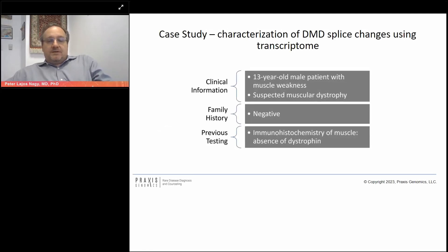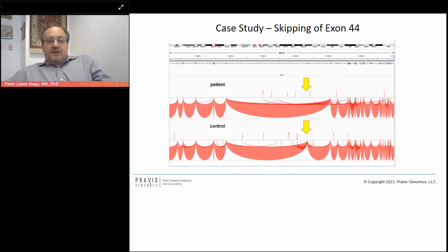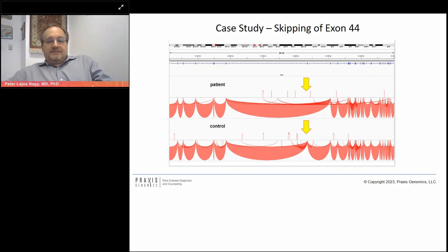Duchenne muscular dystrophy is often caused by splicing defects. Here I show an example of how you can demonstrate the absence of an exon using transcriptome sequencing and reveal the alternative splicing patterns taking place. The yellow arrow in the bottom section indicates the control, which includes exon 44, while the patient on top is missing exon 44 and skipping it in the transcriptome.